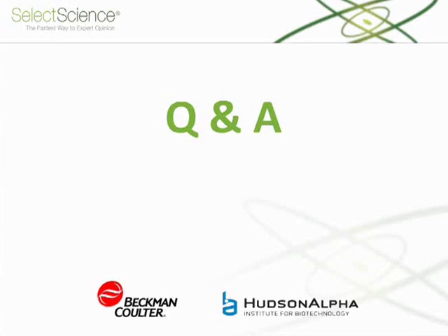But the second part is, I think the statement that it doesn't need any sample preparation may be a somewhat oversimplification of the field. For whole genome sequencing, that would be absolutely true, and you may be able to take naked DNA through the nanopores and get sequence results, perhaps with RNA as well. But applications like reduced representation, methylation sequencing, exome sequencing, et cetera, there still would be a need for sample preparation.